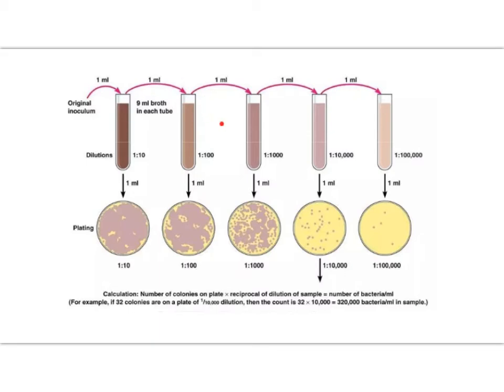You can then dilute it by another ten. One centimeter cubed of the previous solution, add it to this, mix it with water. Make sure you give it a good mix, add nine centimeters cubed of water. Again, there's too many to count. Another ten times dilution, one centimeter cubed of the previous solution, nine centimeters of water, give it a mix, plate it out. Still far too many colonies to count to get an accurate number.